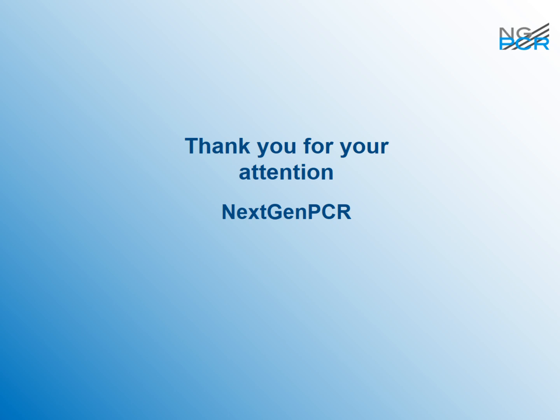Okay. I'm sorry, I'm just going to try and get the last 2 or 3. I know you've been very good, Gert, so sorry for keeping you. I know you probably want to get home for your dinner, but does 3-step cycling get between denaturing temp and annealing temp faster than just a 2-step protocol?